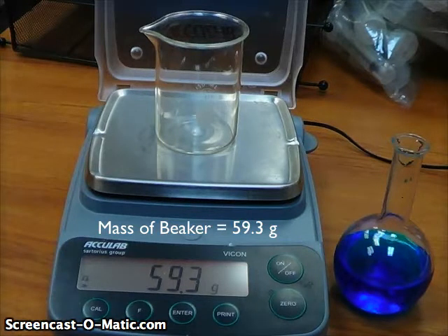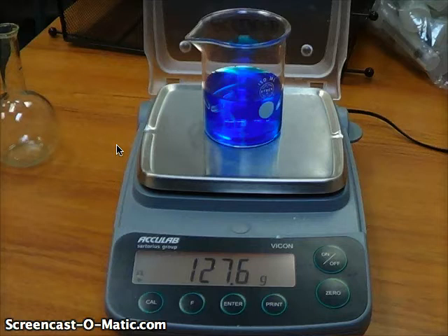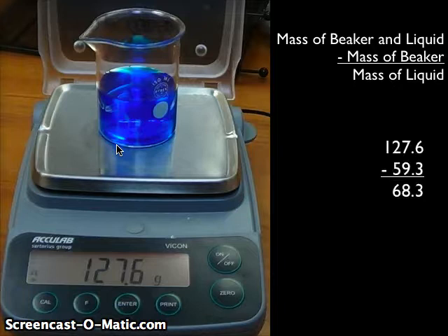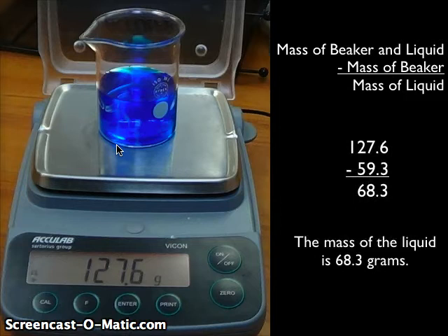Now I'm going to take that beaker off the balance, pour the blue liquid into it, and put it back on. Now I can see the beaker with the liquid in it is 127.6 grams. I can take those two facts, put them together, and figure out the mass of the liquid. If you take the mass of the beaker and the liquid together — 127.6 — and subtract the mass of the empty beaker, all you're left with is the mass of the liquid. So 127.6 minus 59.3 is 68.3 grams, and that must be the mass of the liquid.